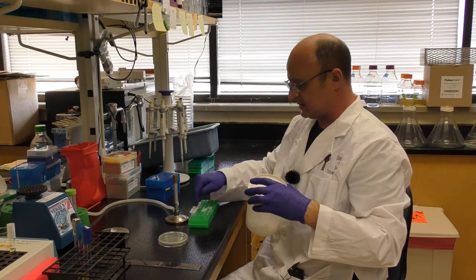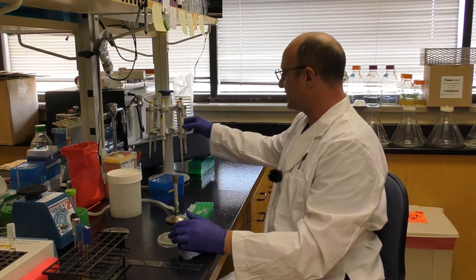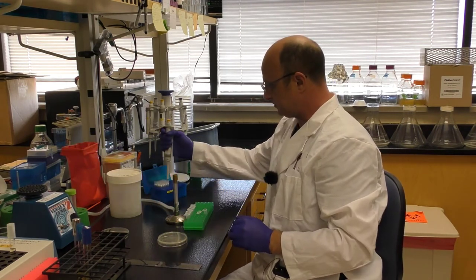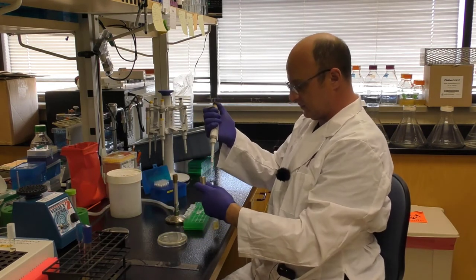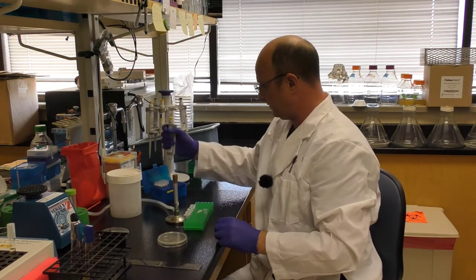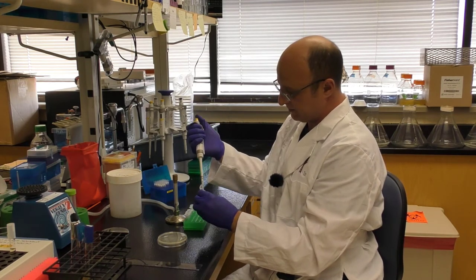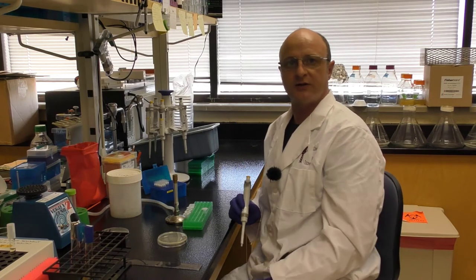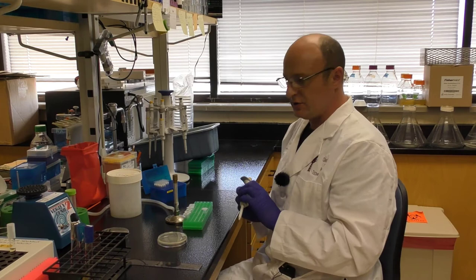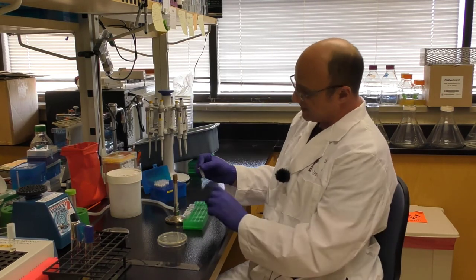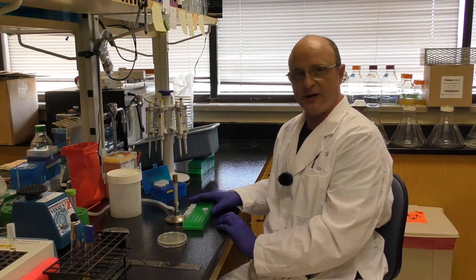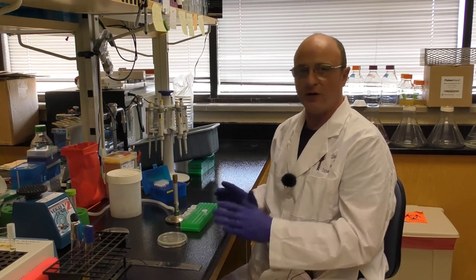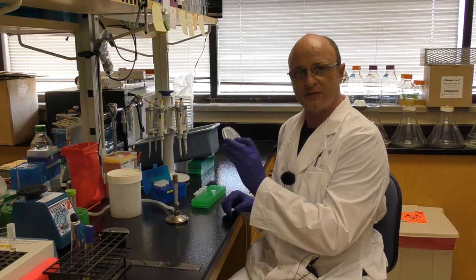I take my 100 microliter pipette. I take 100 microliters of my cells, or whatever the required volume is for your protocol. And 100 microliters of my dilution. And it doesn't have to be 100 microliters. It can be 50 or 150 or whatever, as long as it's a defined volume and you record that volume so you can use it in your calculations. Cells and phages have been mixed, give it a little tap to ensure they're properly mixed. And then we want to let that sit and incubate on the bench for about 5 to 15 minutes. It's very important that you don't go too short because you want to allow the phages to adsorb to their host. You don't want to go too long because you don't want progeny phages to be produced, which will obviously completely invalidate your calculations. And then while that's incubating I'll take the time to label up my plate.